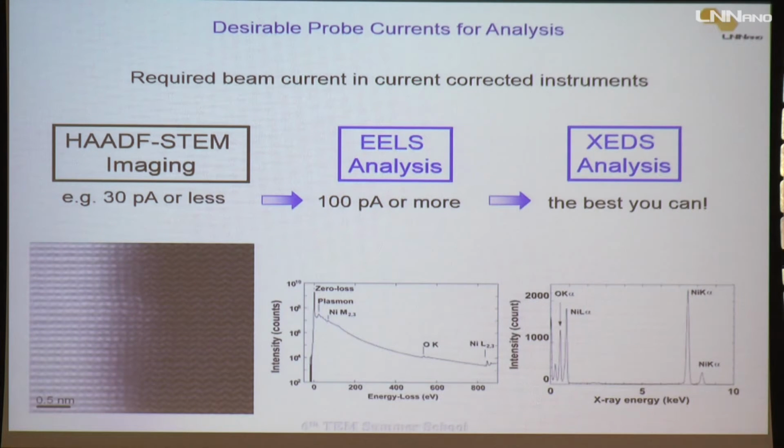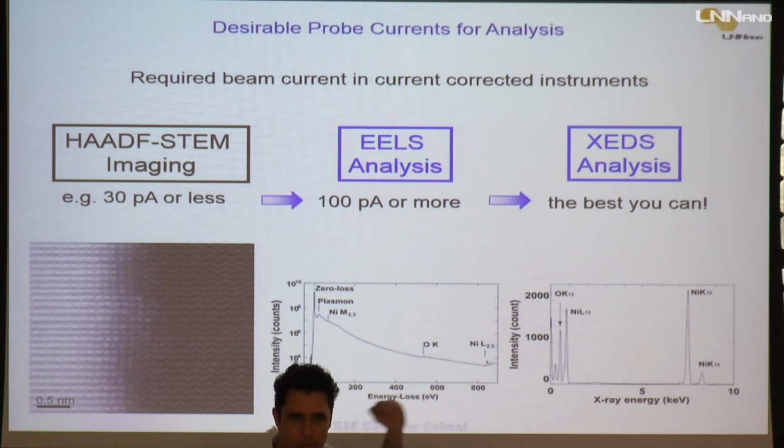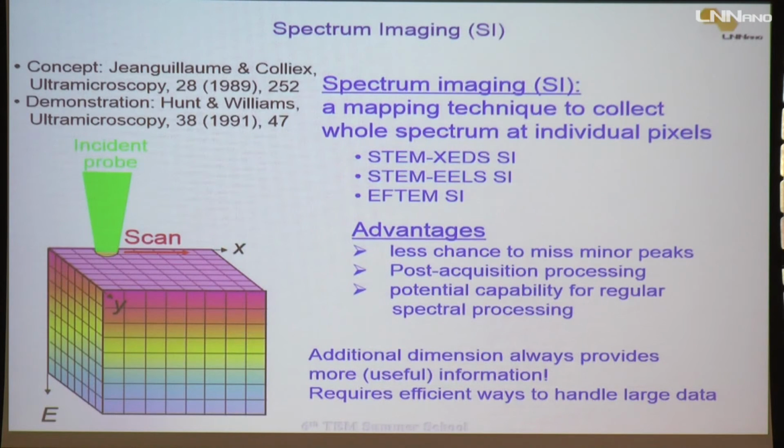even with the best machines, the best spectrometers, all the best, the technique is not good. You have many problems, you need to deal with many limitations, and then you need to put all the signal you can in your sample, okay? Then there is this compromise between the image you get, the resolution of the image, and the spectroscopic information you can leverage from this pyramid.